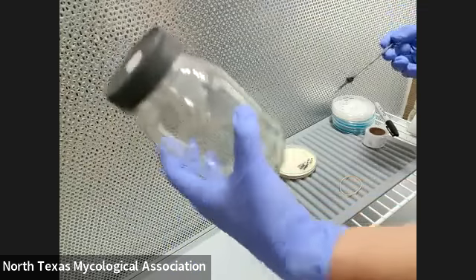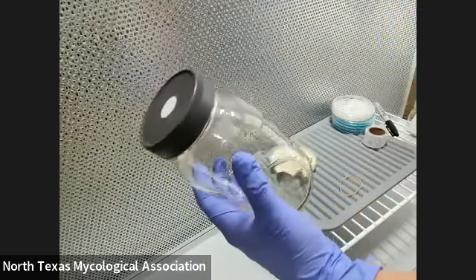Shake it up to spread the mycelium. And that's it for the grain transfer.